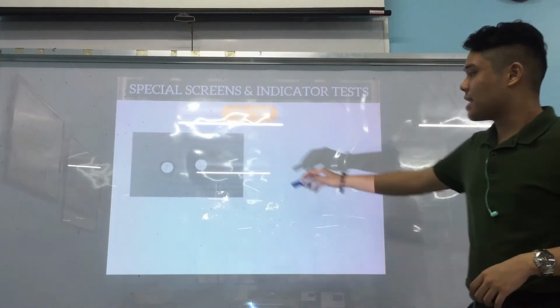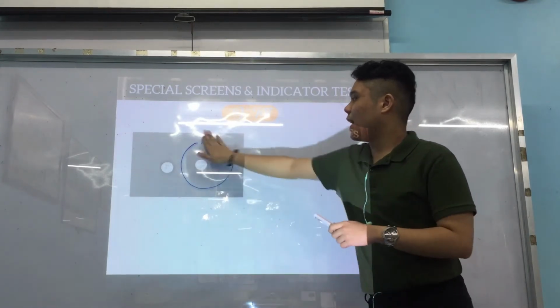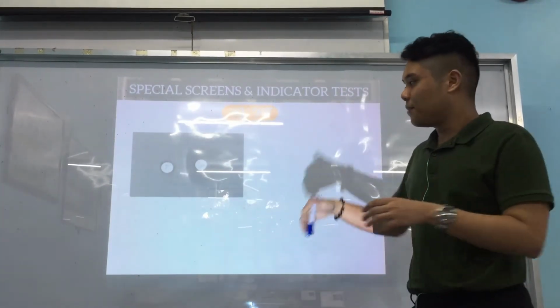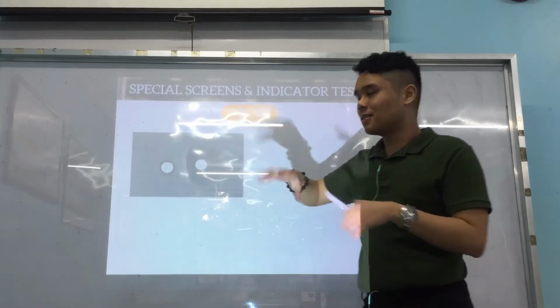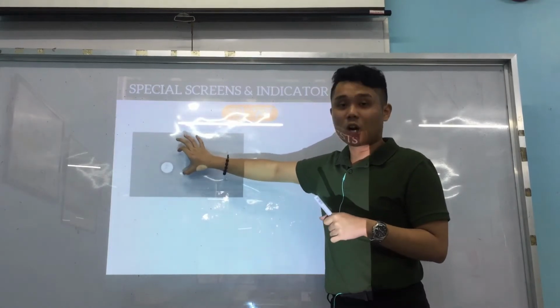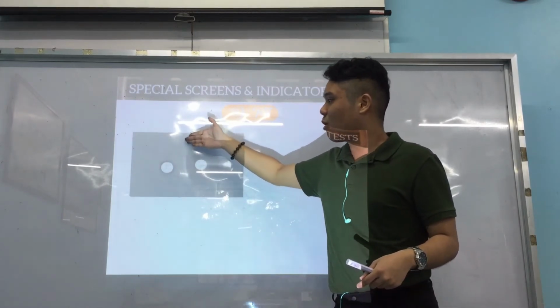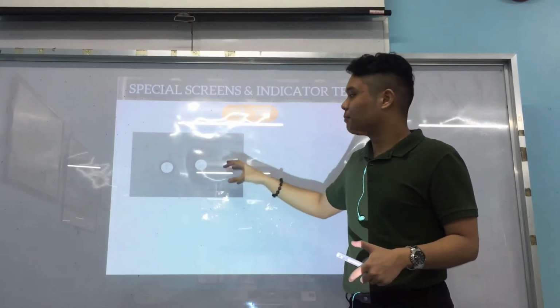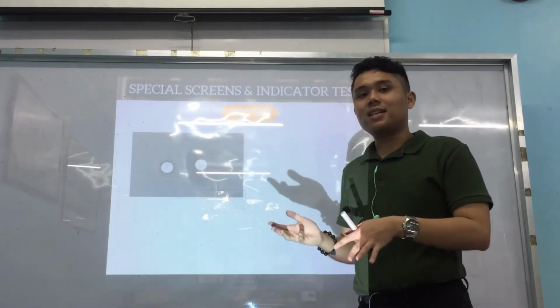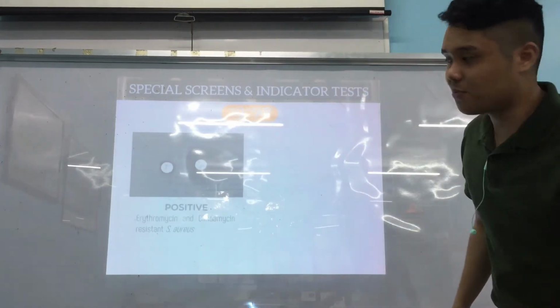As you can see, this is clindamycin. The normal zone of inhibition should be a circle, a sphere. But in this result, there is blunting, like the letter D. As you can see, the erythromycin shows resistance, with no zone of inhibition. So the ERM gene worked, provided by the erythromycin. The clindamycin could not complete its zone of inhibition. So there is inducible clindamycin resistance, because there is now resistance to clindamycin contributed by the erythromycin. And that is considered positive for the D-test.